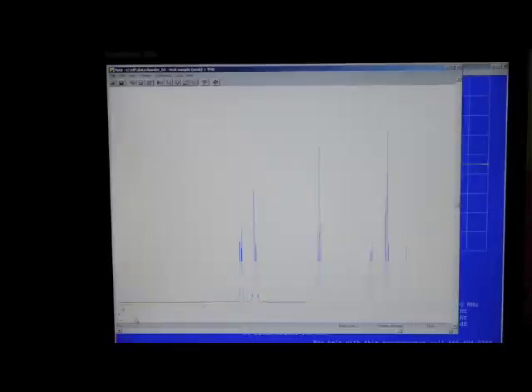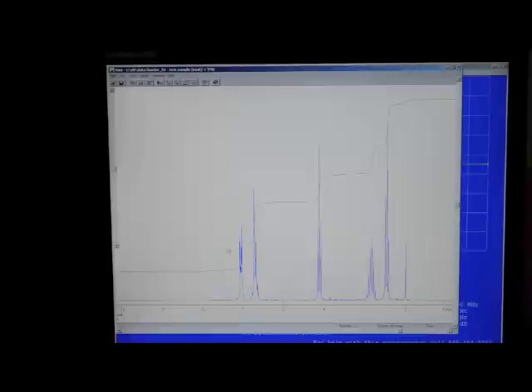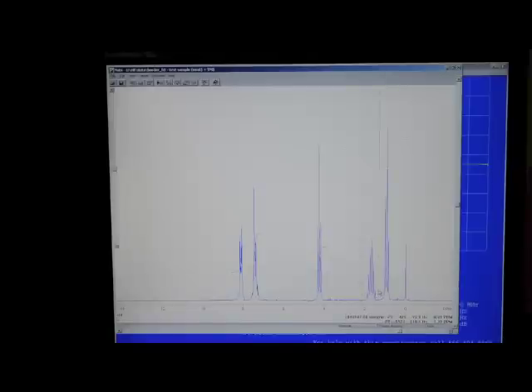Type AP to autophase the spectrum. Type BC to correct the baseline. Type ID to enter the integration routine. Click once to get a vertical cursor. Click again on the left and then to the right of each peak. It is usually not worth integrating the TMS peak.